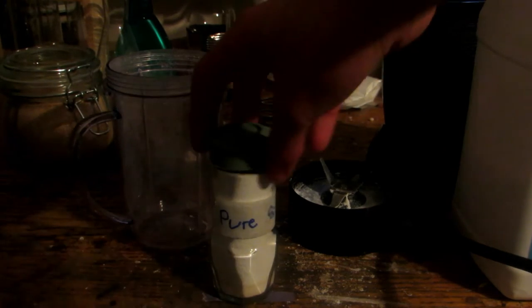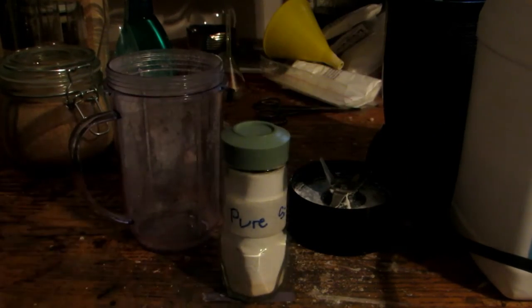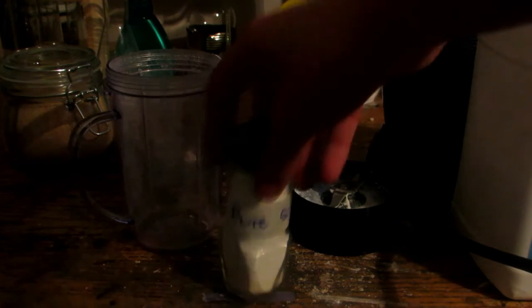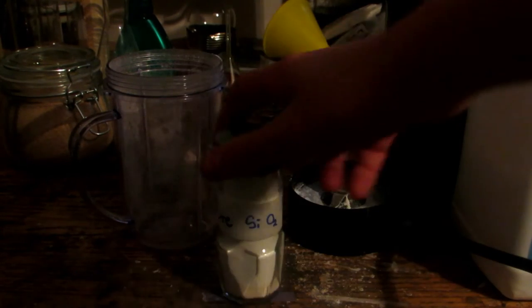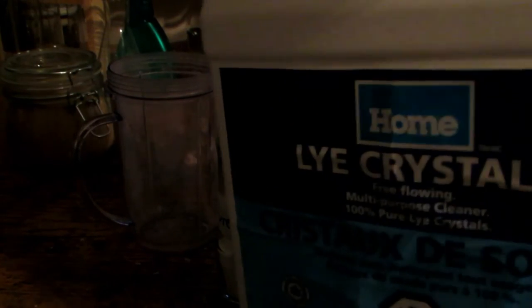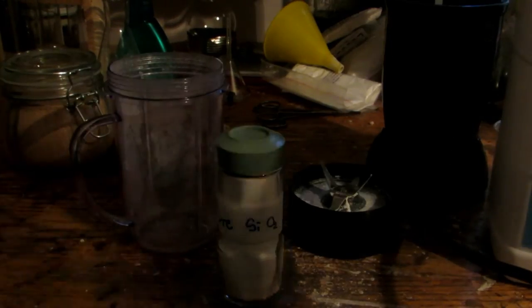We purified that sand into pure silicon dioxide by first converting it to sodium silicate, then to silicic acid, then back to silicon dioxide, with several purification steps in between. So we have our pure silicon dioxide here, and we have some sodium hydroxide. This is just known as lye crystals and can be bought from home hardware.